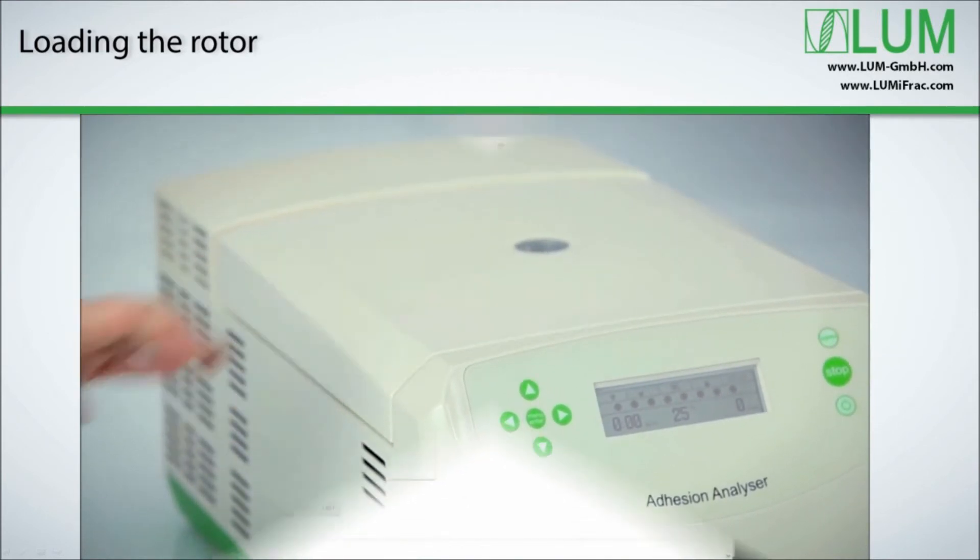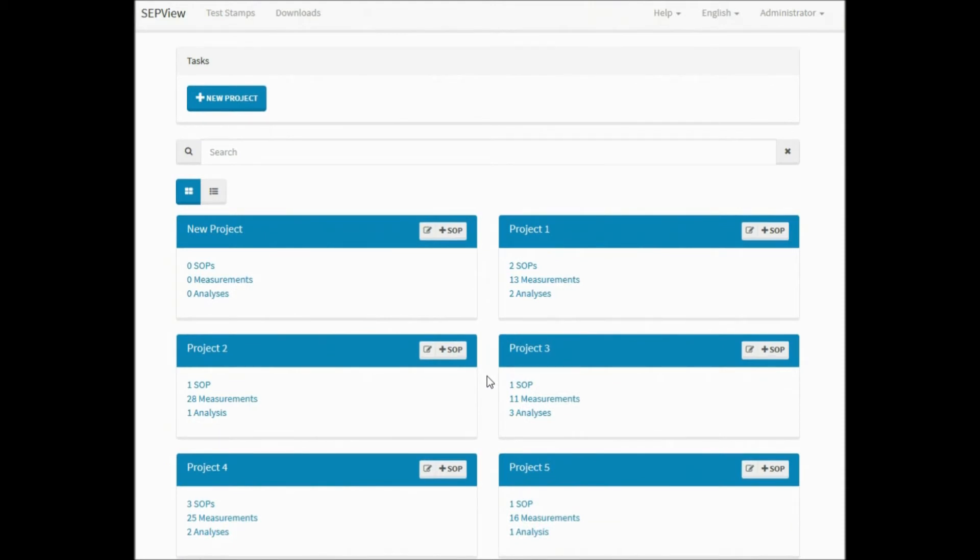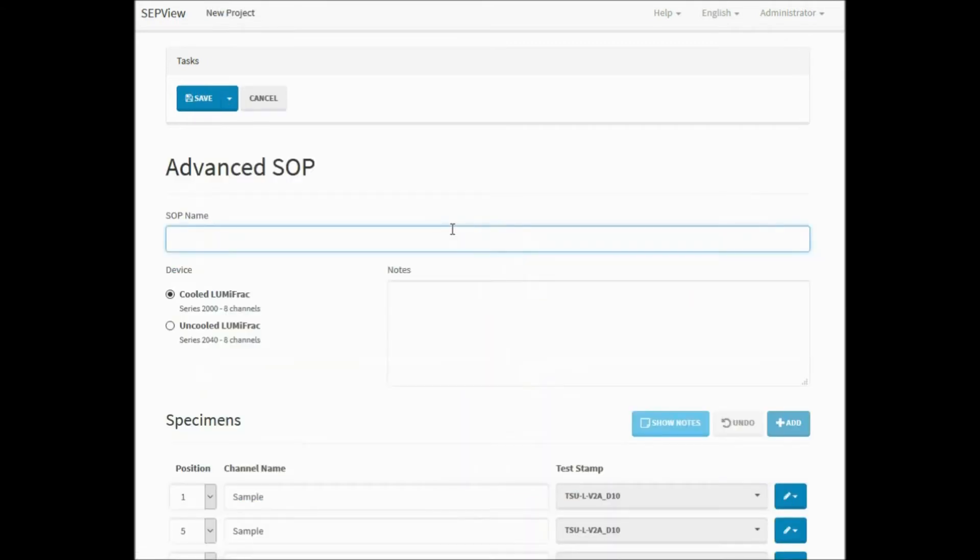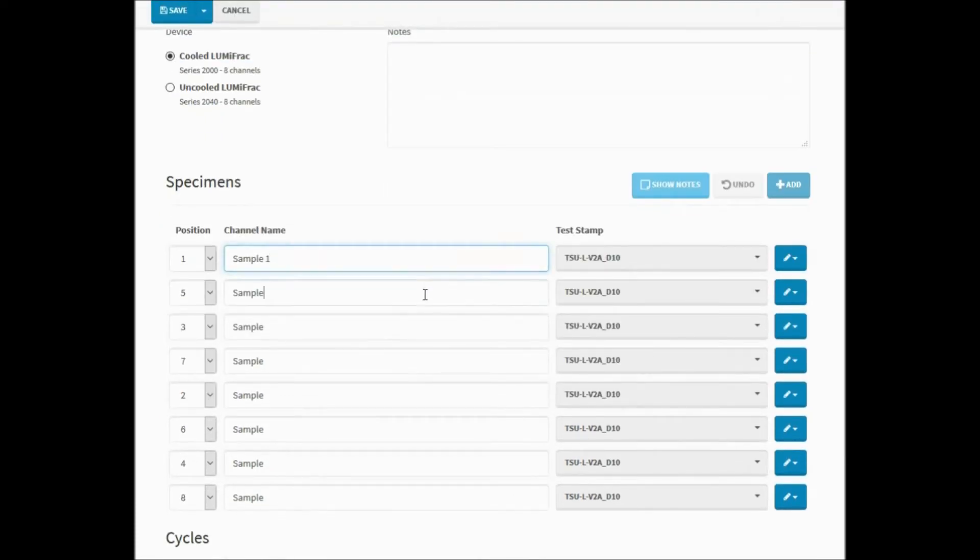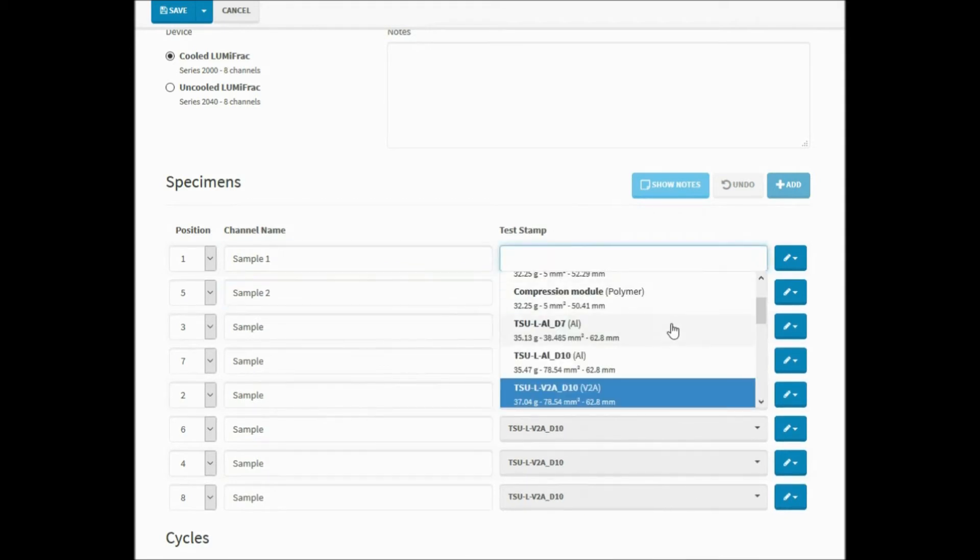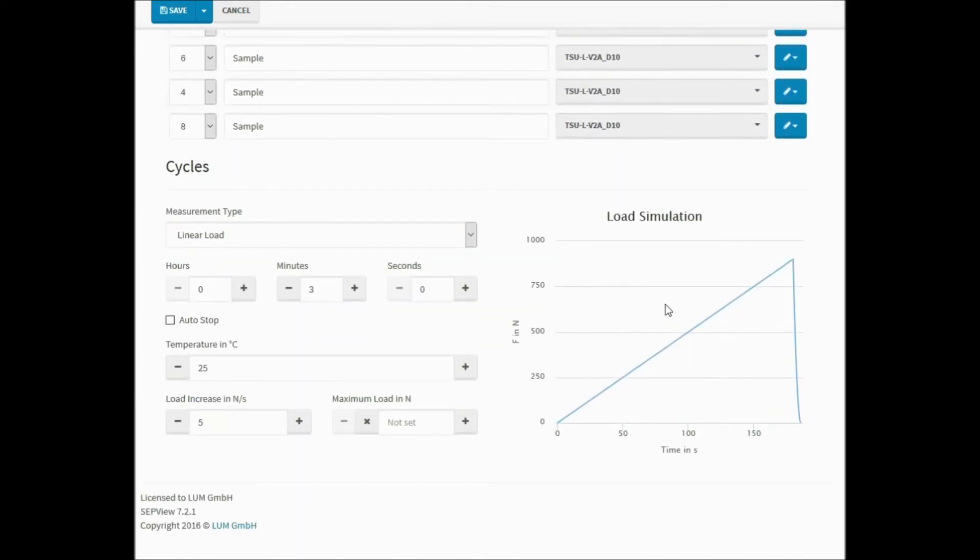We then start the physical measurement and simultaneously open the SepView software on our computer. Create a new SOP by clicking on the corresponding buttons. The SOP wizard opens to conduct the necessary settings. Name the SOP, then enter the names of your samples and select the test stamps to be used. Predefined test stamps can be selected by clicking on a drop-down menu. Measurement parameters are operational defaults of the analytical centrifuge. They depend on materials used, like different types of adherents and adhesives. The four measurement types allow for two kinds of standard short-term testing as well as two special long-term measurement options.